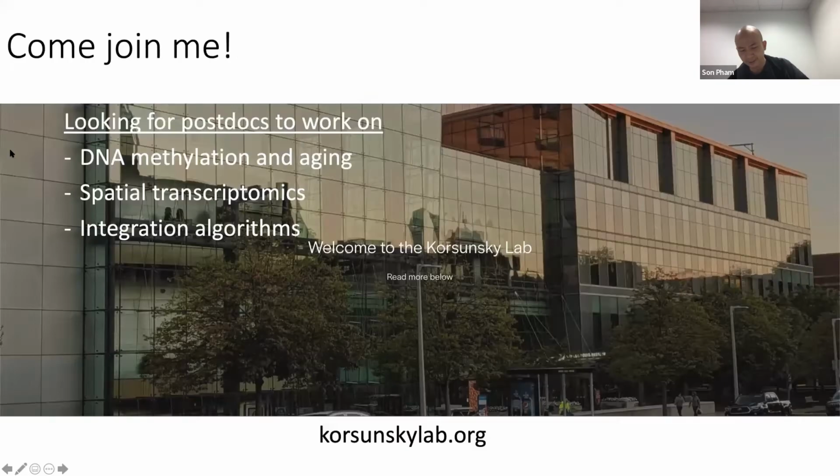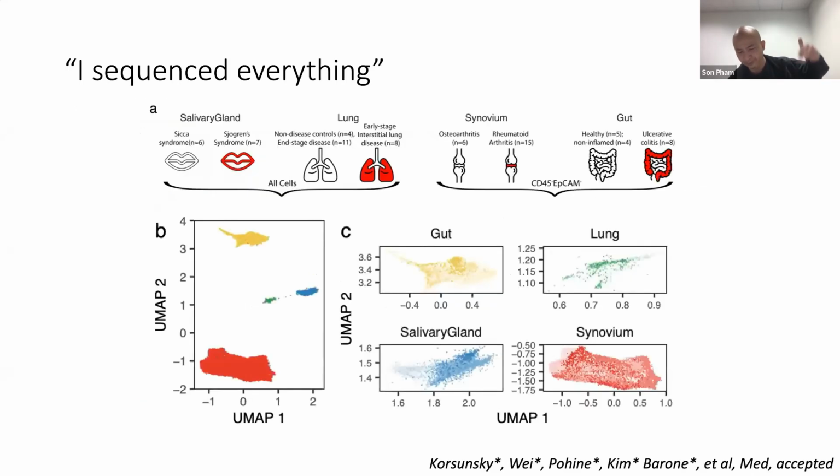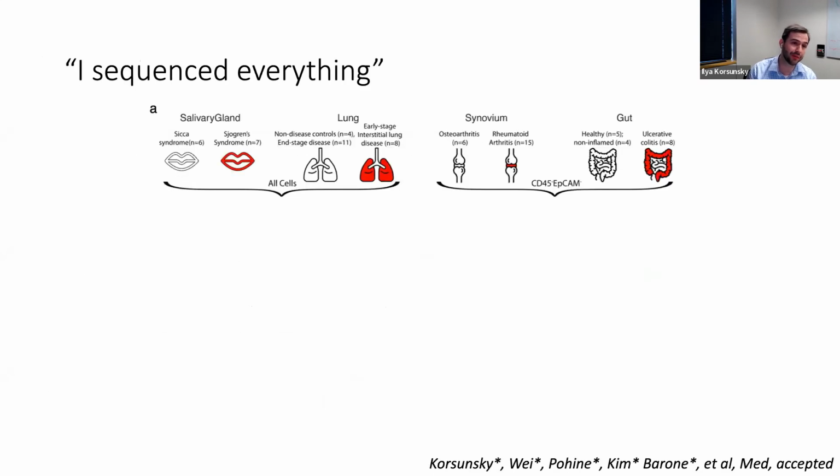Is it donor plus tissue, like you do batch effect one at a time, or is this the multiplication of donors and tissue? Both. Yeah, we modeled both at the same time because they're not independent variables. In this case, they're actually nested variables because we only had one donor for every single tissue, for every sample. We didn't have paired tissues for any one donor.